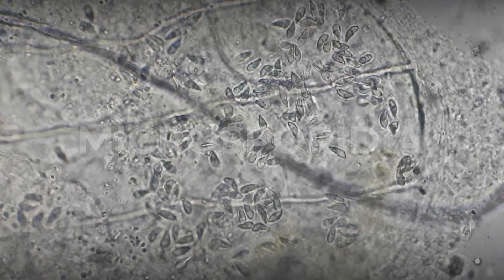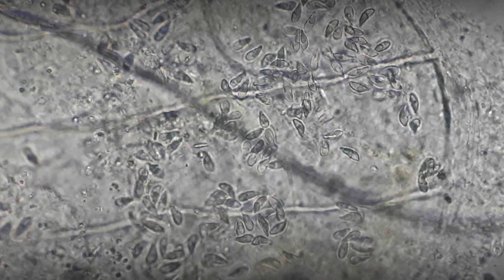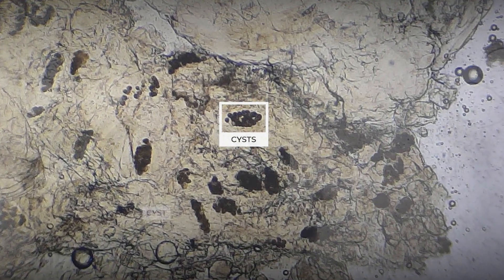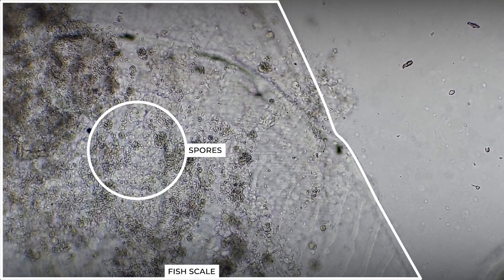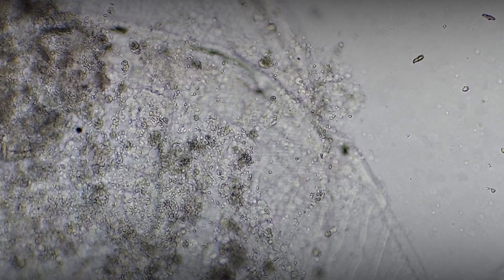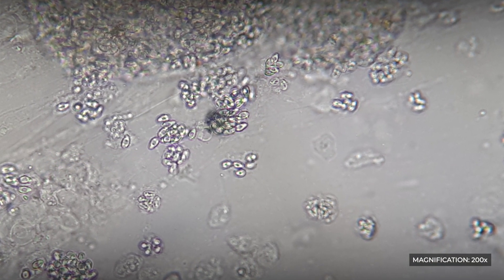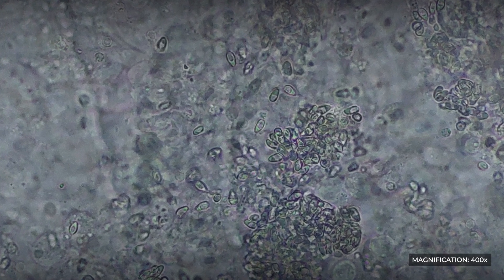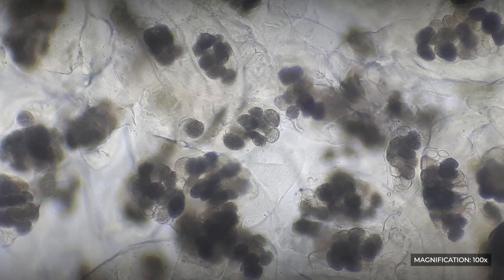Microsporidia is another group of spore-forming parasitic organisms, of which currently about 1300 species are known and new species are still being discovered. All Microsporidia intracellularly parasiticize eukaryotic organisms. A frequently occurring disease in aquariums is Pleistophorosis, caused by Pleistophora hyphizobriconis, which affect fish of the genus Hyphizobricon, the tetrafish. Under the microscope, individual spores and cyst-containing spores can be detected. Spores have a characteristic oval shape, with an ejector capsule inside, which make them resemble a slipper. In affected fish, white patches form in the area of the back muscles, where the parasites develop and form cysts with spores.